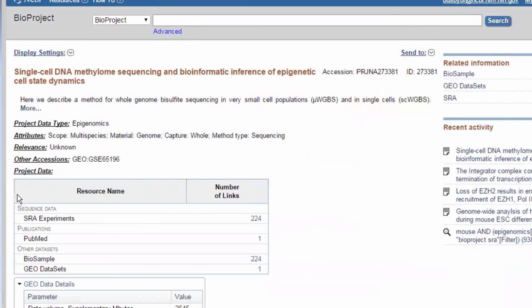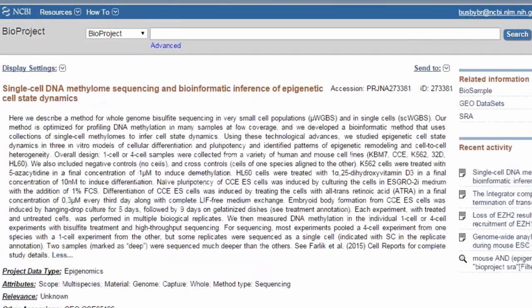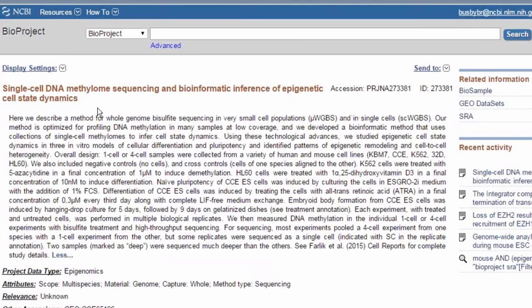So here I get an umbrella project of 224 SRA experiments linked to a PubMed abstract and also GEO datasets, which are pre-analyzed data analyzed by the investigators that submitted this data. Some of the features of this are being able to look at the abstract that they've submitted to BioProject.